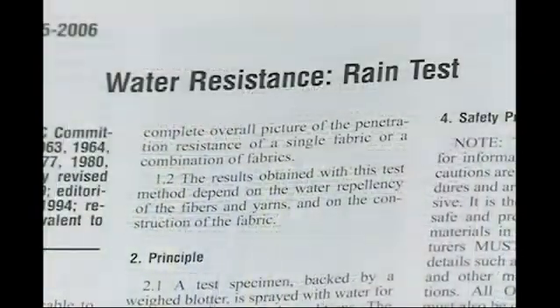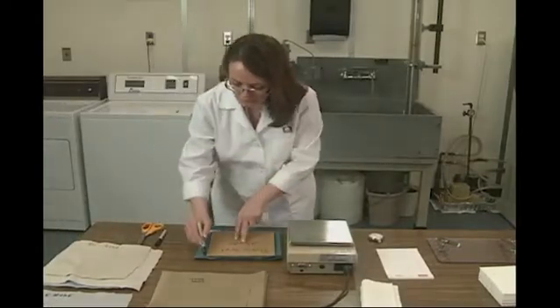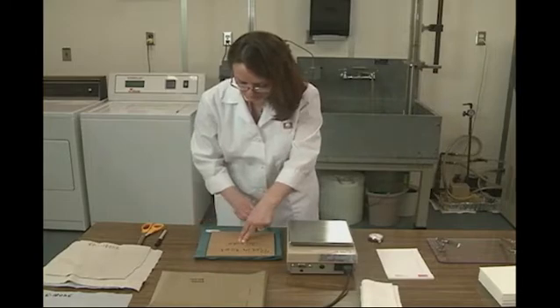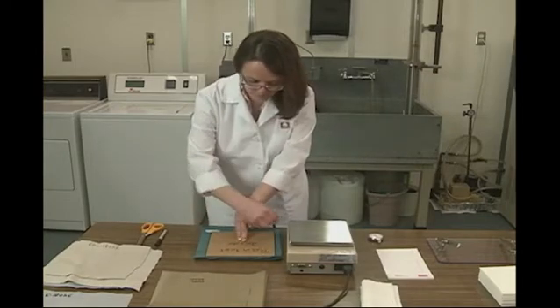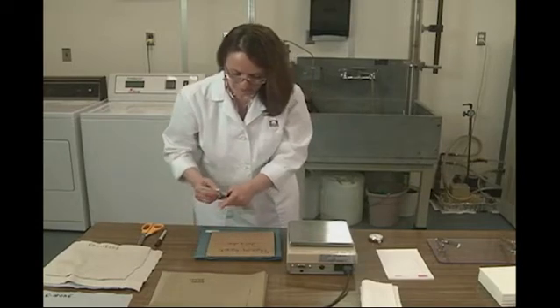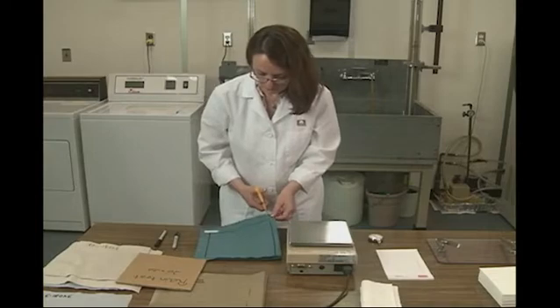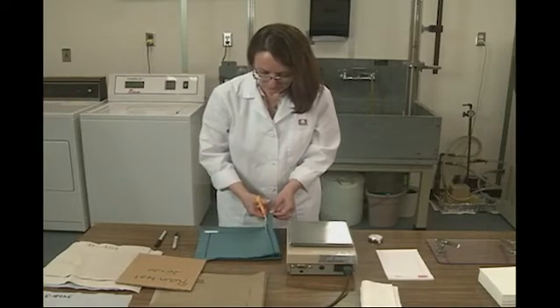The rain test was originally published by AATCC in 1947. This standard has been reaffirmed and revised and been in use since it was developed. The Department of Homeland Security, U.S. Customs, requires importers of water-repellent and water-resistant coats to pass the rain test. Therefore, the method's utility for textile research and finishers, as well as for brands, is important to the process of getting goods into the U.S. market.